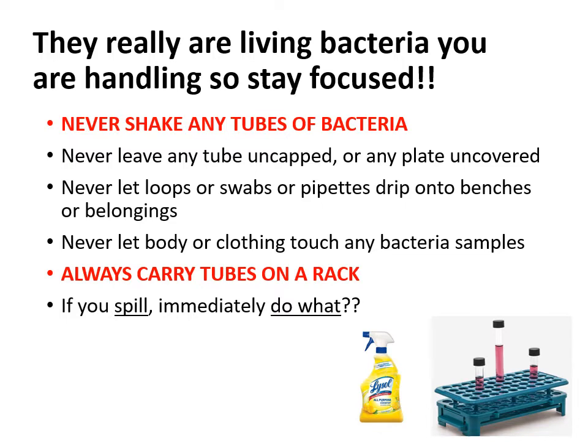Now, again, because we are a BSL-2 lab, you will be working with organisms that have the potential to make you ill, but for which there are readily available treatments, okay? But you still do not want to get any of these bacteria on you, on the lab benches, anywhere. So please be careful about not shaking any of the tubes that you have, which can create aerosols, fine particles throughout the air that you would breathe in, and can also create spills that become problematic.